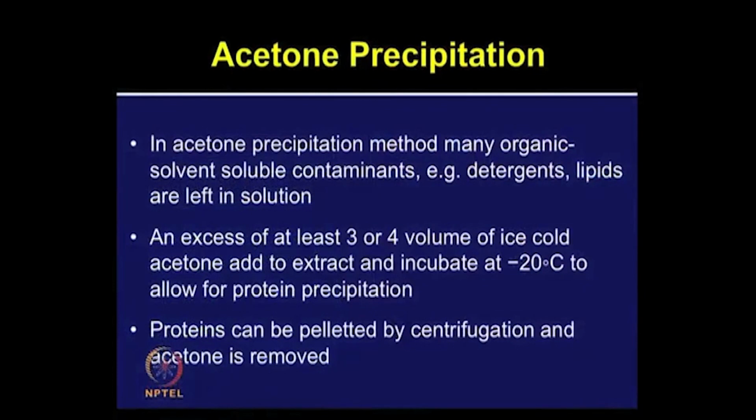Now, let us talk about acetone precipitation. In this method, many organic solvent soluble contaminants such as detergents and lipids are left in solution. So, it is very effective.